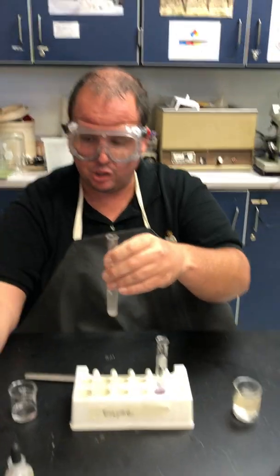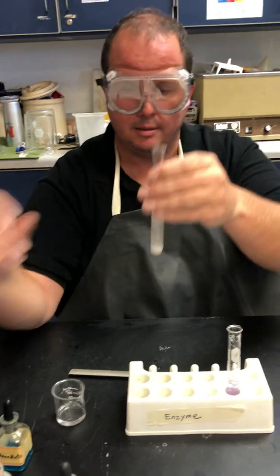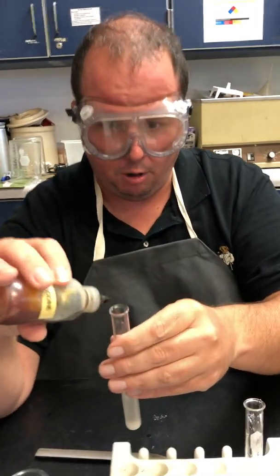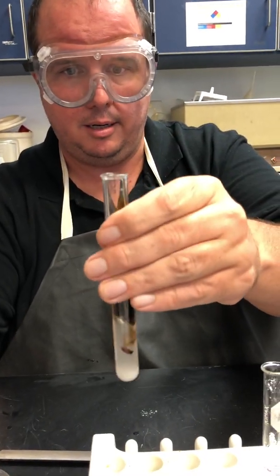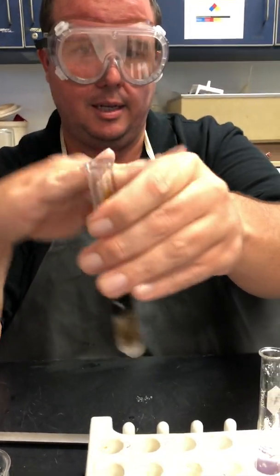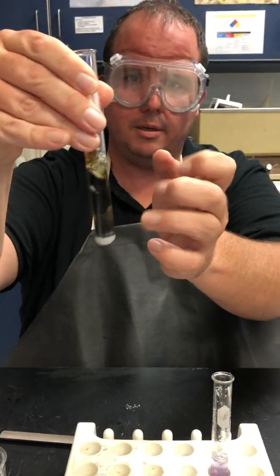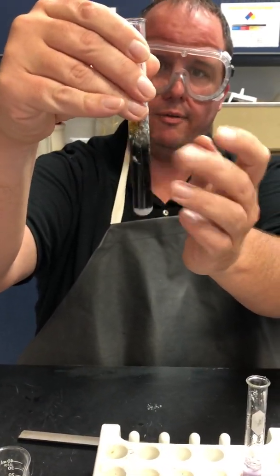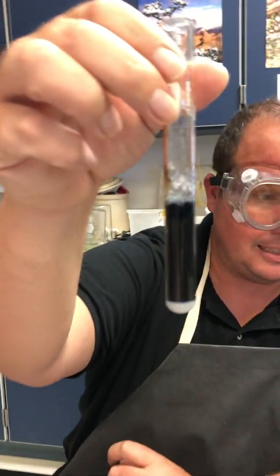All right, I'm going to make sure I mix this again. How many drops, Miss Murdoch? It won't take much at all. Maybe 1 drop will do it. Oh, I just squirted on myself a little. It will not hurt you. I'll just clean that up and rinse that off my hand. Oh, that's beautiful. I love these indicators. Oh, look at that!